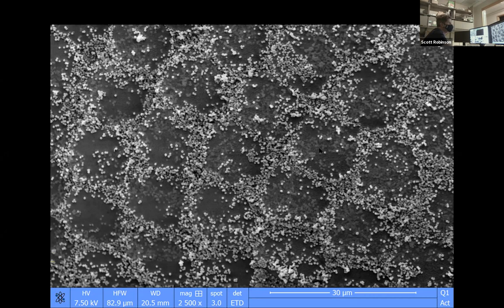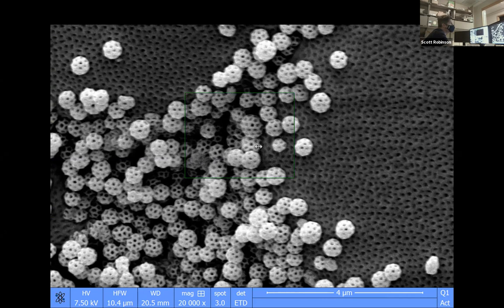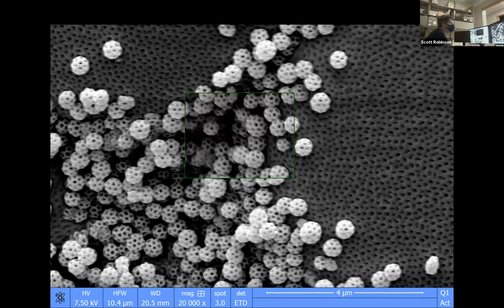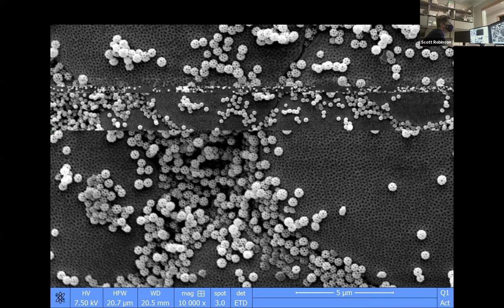And then if we want to see what they look like, we'll bring the magnification up, and I hope you can see these now. We'll bring them to a little bit higher mag. They're really, really beautiful little things, like wiffle balls almost, that are created in the Malpighian tubules of leafhoppers. No other insects that we know of do this. And they are usually about 250 to 450 nanometers in diameter. So these are on the nanoscale, really beautiful little wiffle ball-like features.